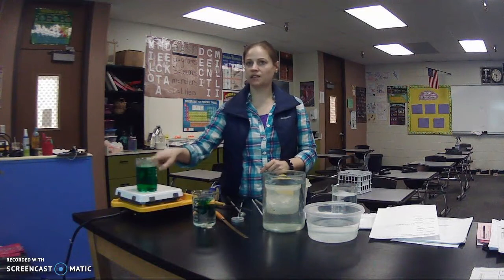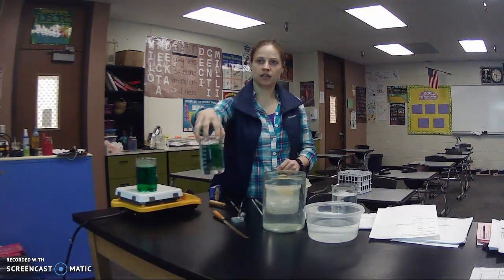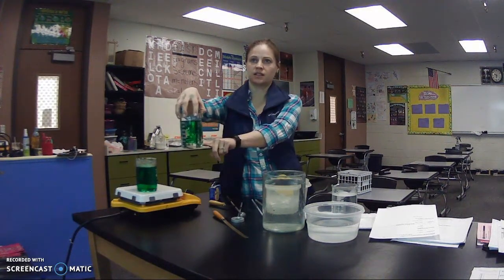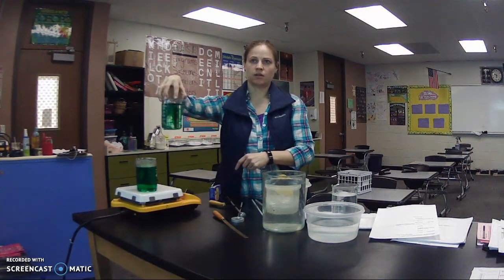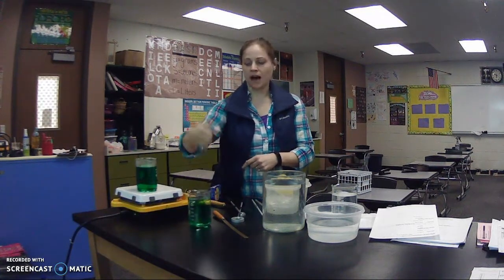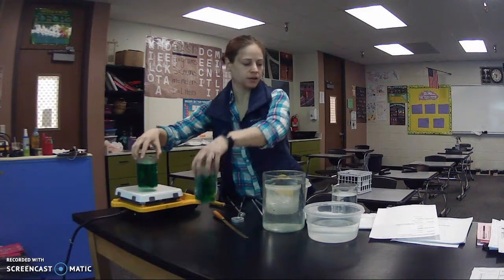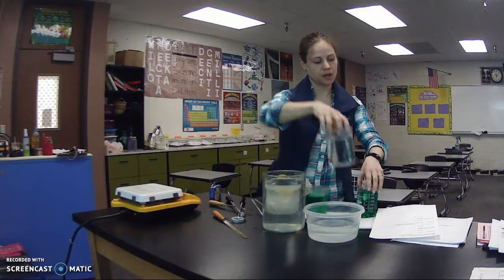Notice that the dye has already mixed here. And here, you can tell there are places where it's very clear. Maybe you can see better with the white in the background. Okay, what happened in beaker A? What happened in beaker B? I'm going to set these aside. That was the first demonstration.